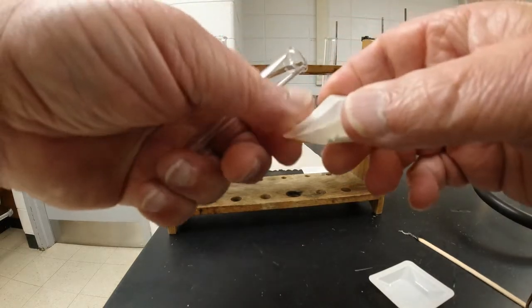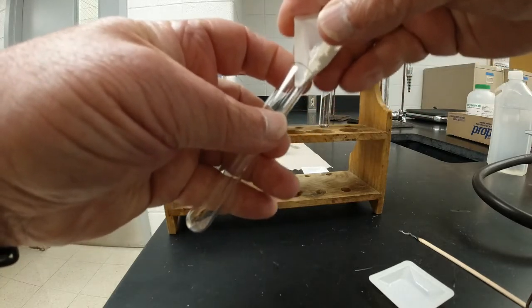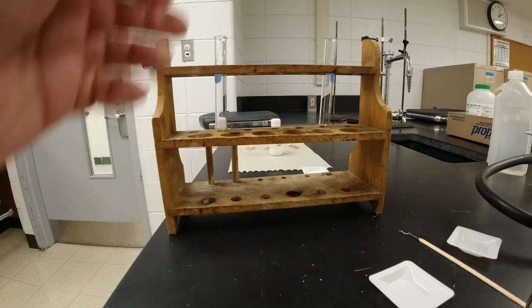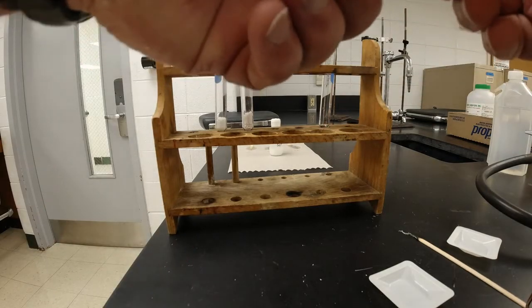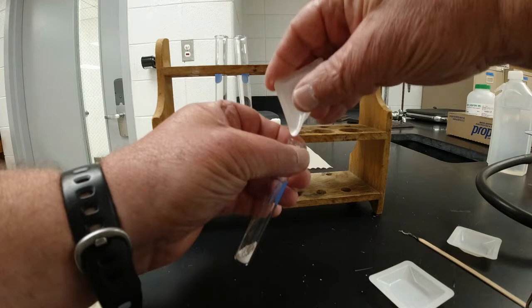And I bend this one a little bit. All right. That was kind of hard, but there is the calcium sulfate. And the last one is the barium sulfate. There we go.